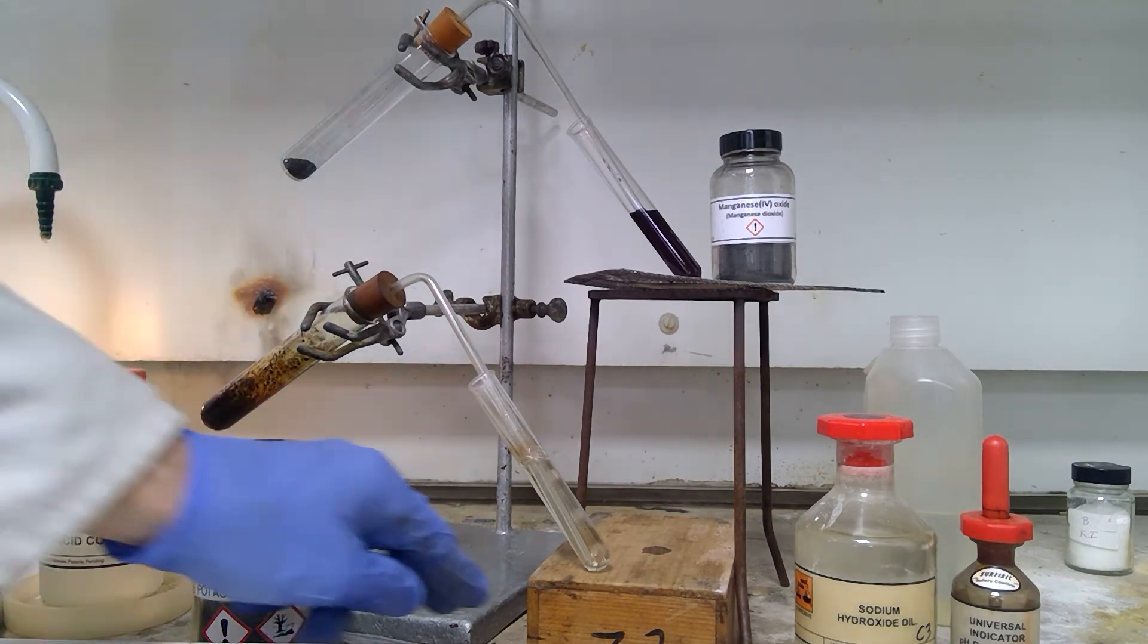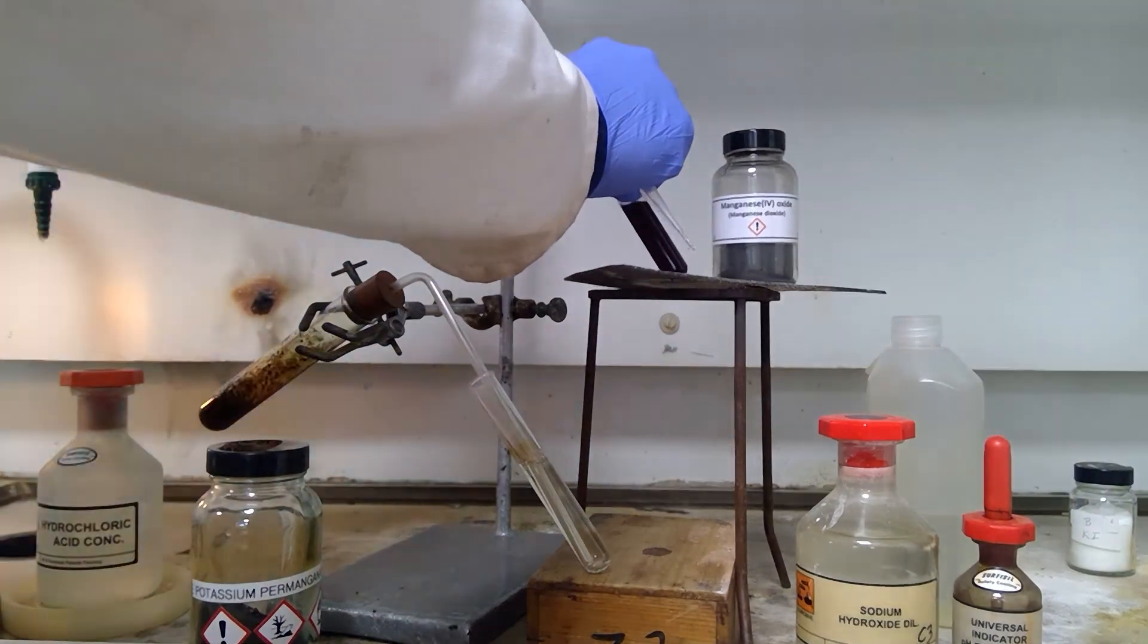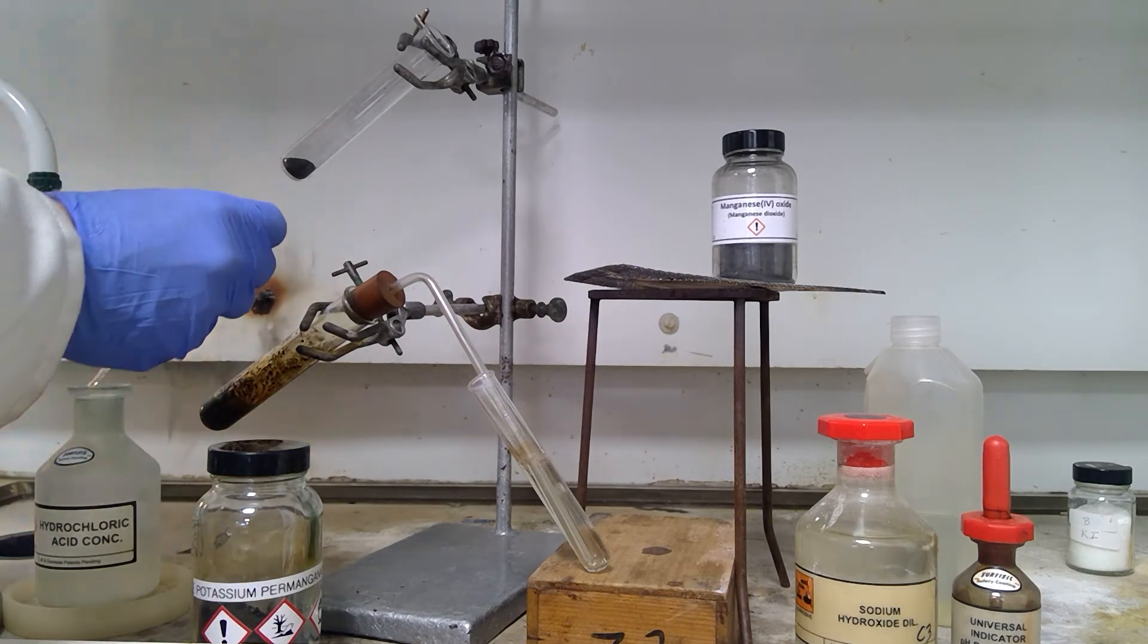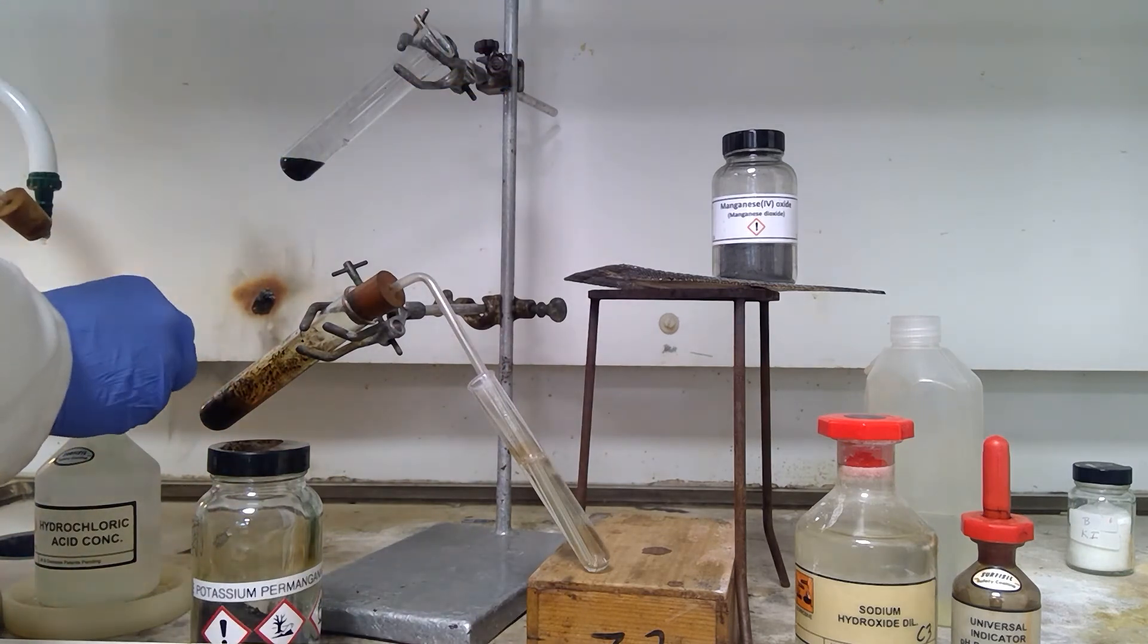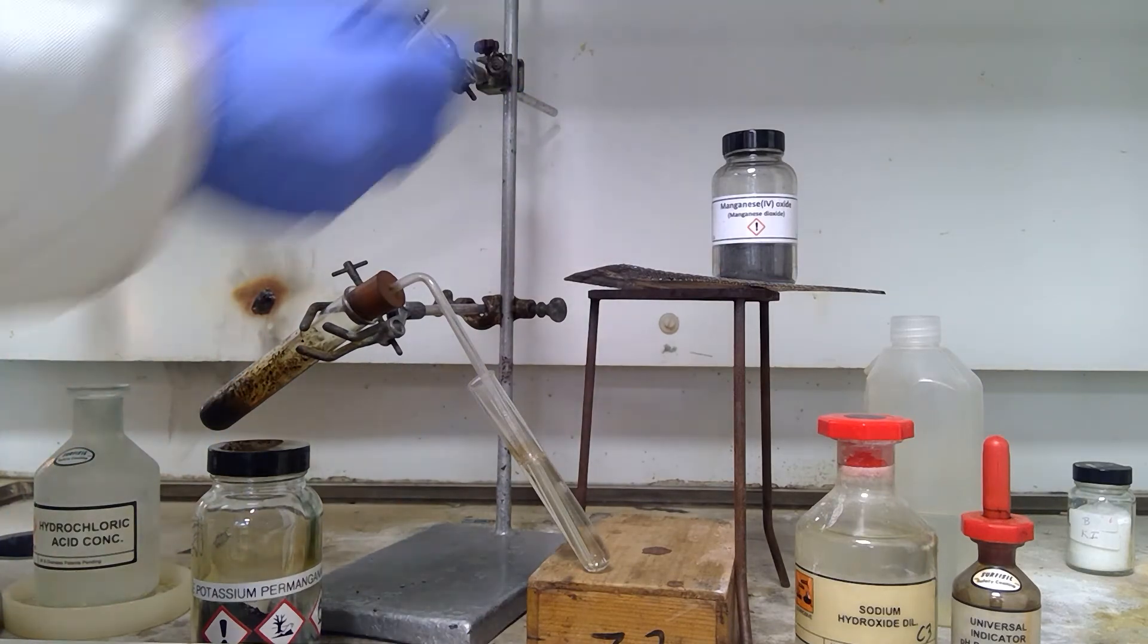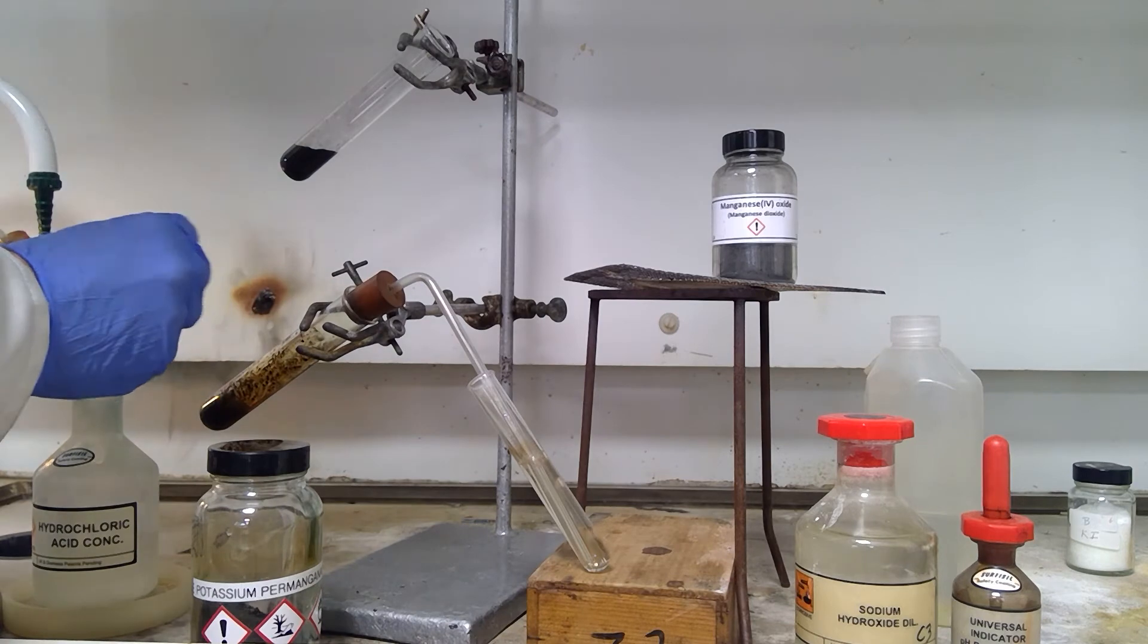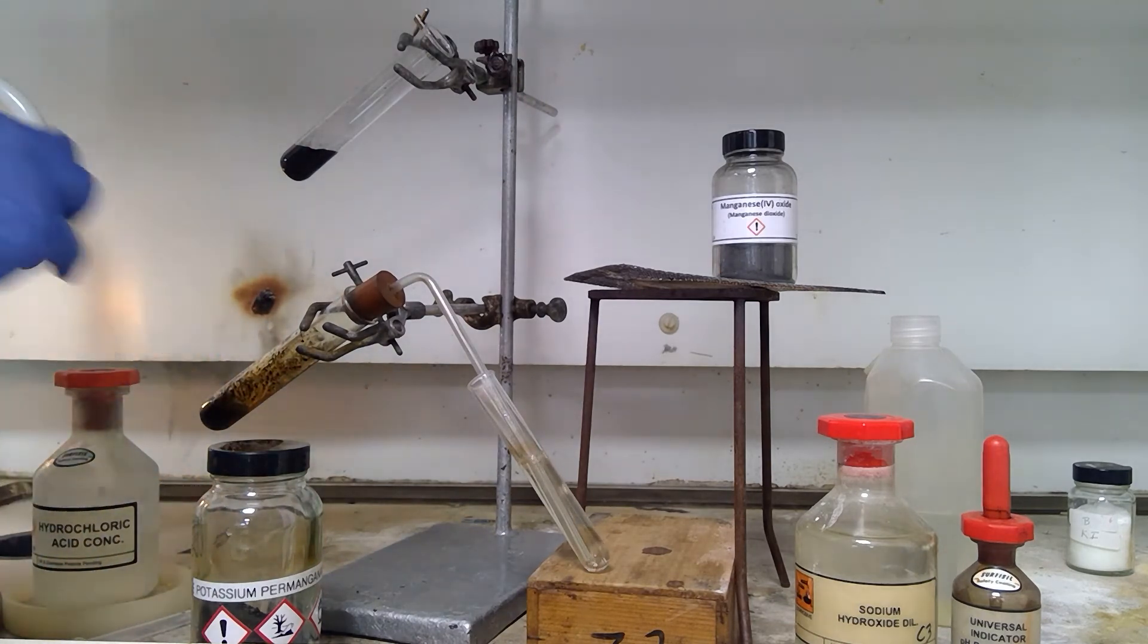If we compare this then with the reaction that we can do with manganese 4 oxide, we do the same thing. So I will put 3 cm³ of the concentrated hydrochloric acid into this one. You may already be able to see that the reaction is a lot slower, and indicates the relative strength of the oxidizing agent, manganese 4 oxide, in comparison to the permanganate.